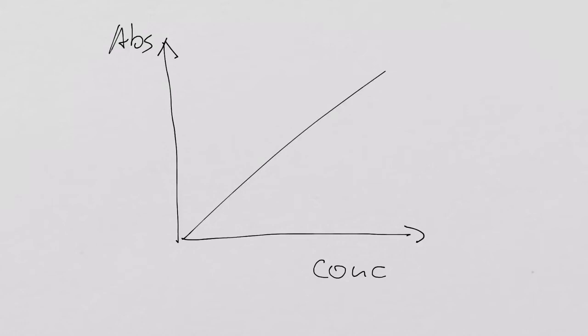But from this standard curve, we then can actually say, right, let's use our unknown sample, let's measure the absorbance, which we just did, it's 0.25, and from this, we just simply read it off here. So if that is 0.25, we read it off here, and that corresponds to this concentration. Does that make sense to you? Yeah? You see what a standard curve actually does.